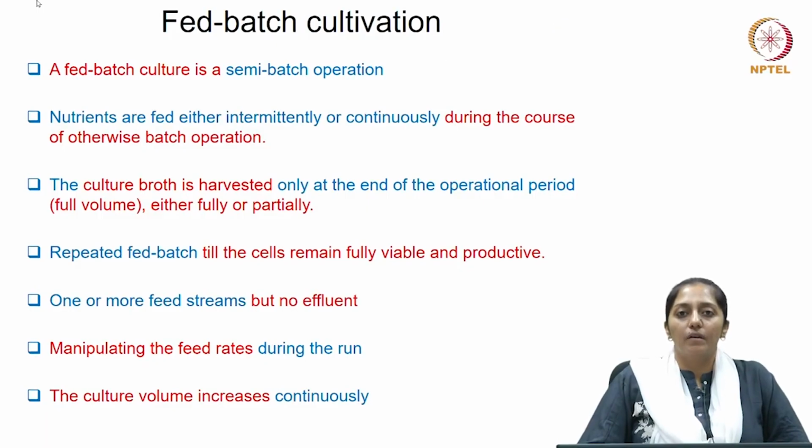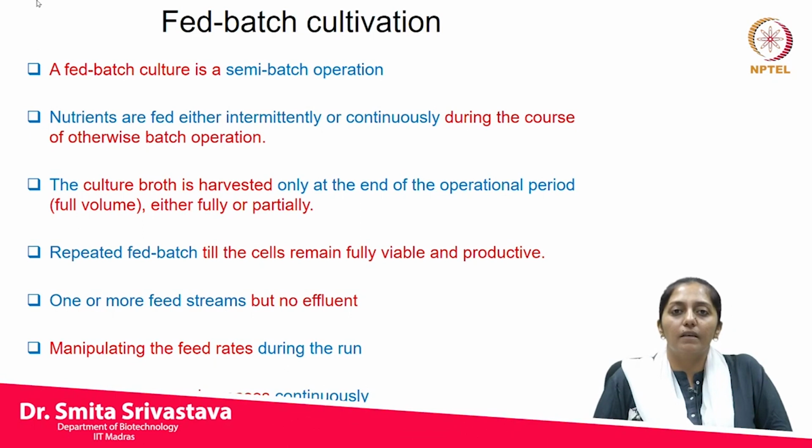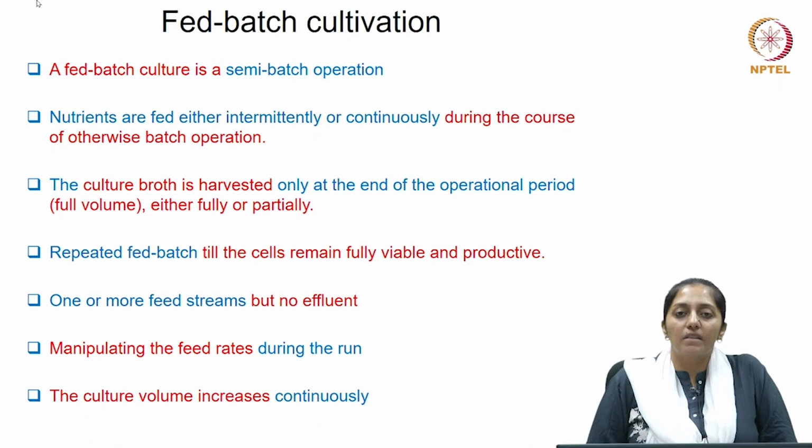Welcome back, students. So in the last class we were discussing design of batch reactors. Now in this class we are going to move ahead with the design of fed batch reactors. If you remember, in the introductory lectures I spoke about the different types and modes of cultivation, in which batch mode of cultivation was one, which we call batch reactors, and then there was fed batch mode of cultivation, and the reactors where fed batch mode of cultivation is done are also termed as fed batch reactors. So let's see how to design a fed batch reactor.